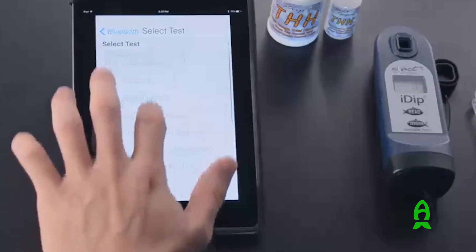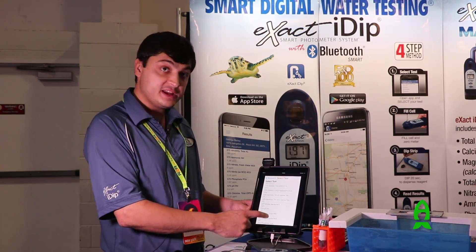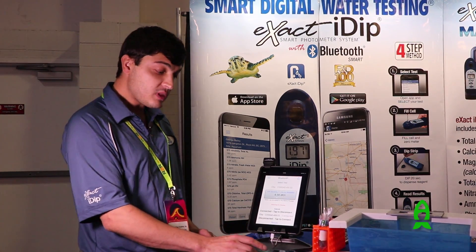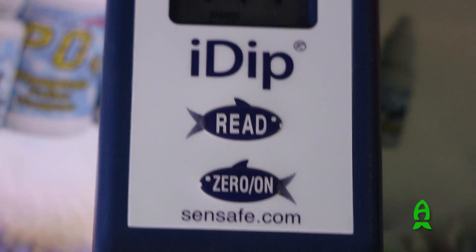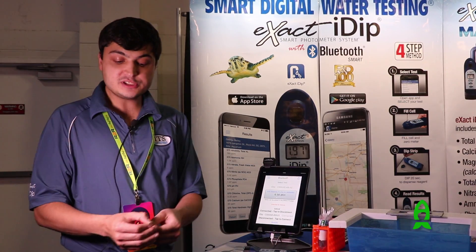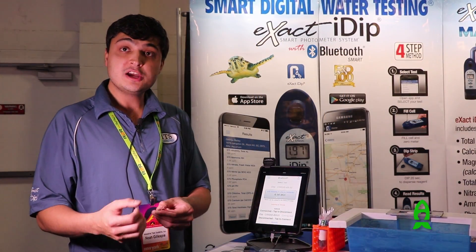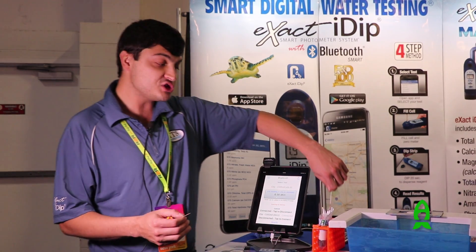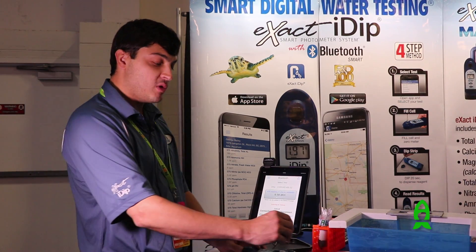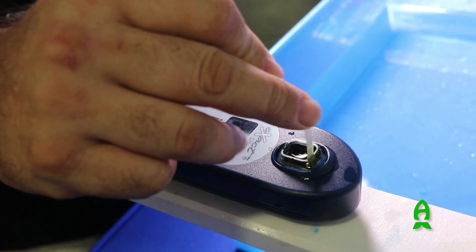In the app you can see every test the instrument is capable of running, such as ammonia, calcium, hardness, pH, phosphate, and nitrate. I'm going to run an alkalinity test — so you'll select your alkalinity test. Then you're going to zero the instrument, which gives you your baseline for your water. You'll take an alkalinity strip. Every strip has its own unique reagent on it, and the repeatability from test to test means every strip has the exact same amount of reagent — so there's no more measuring, no more drop counts. Once it's zeroed, you press read, and it gives you a 20-second countdown timer. For those 20 seconds, you run your strip back and forth, releasing the reagent into the water.